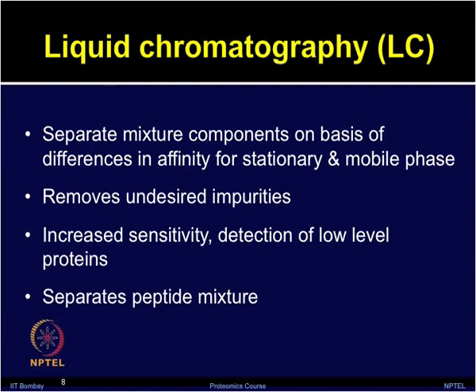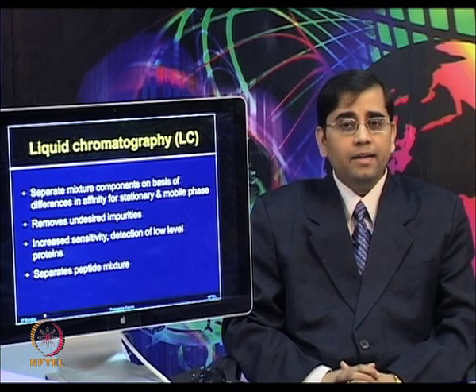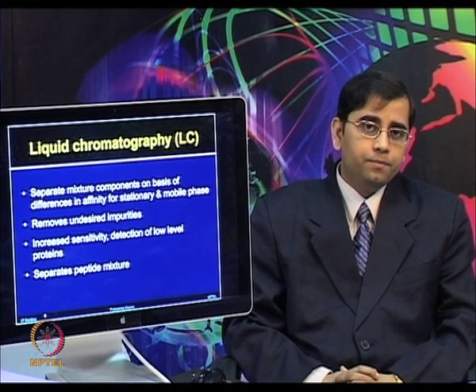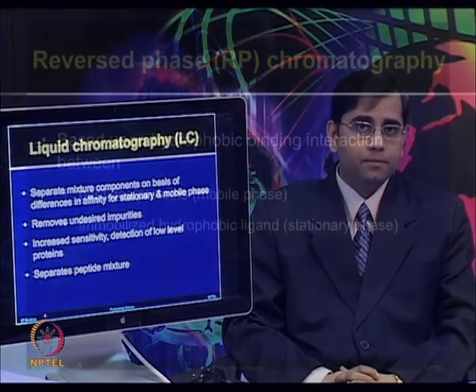Liquid chromatography is also useful for removing undesirable impurities. It also increases reproducibility in the samples as well as robustness of the MS measurement. LC along with further enrichment can help in the concentration of diluted samples. It also helps in increased sensitivity, detection of low level proteins, and further it can separate peptide mixtures.